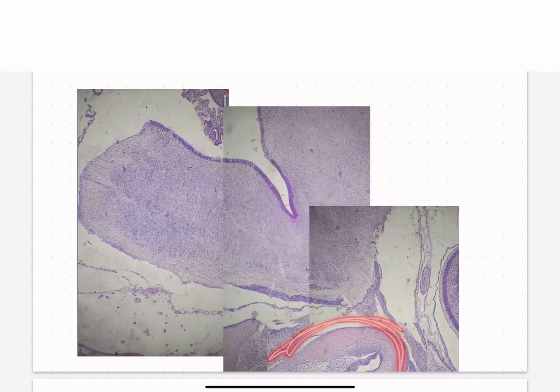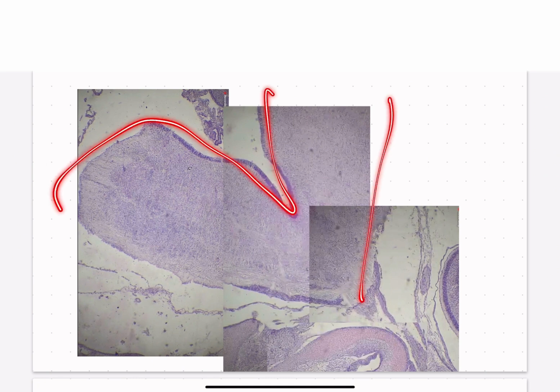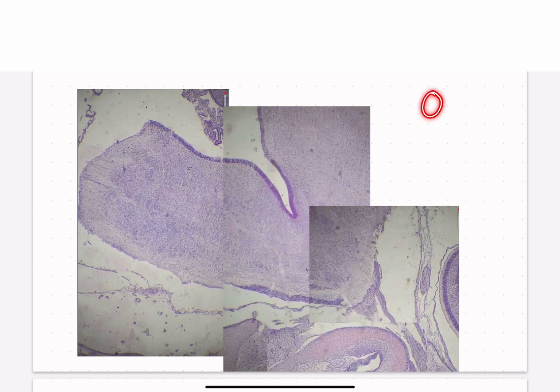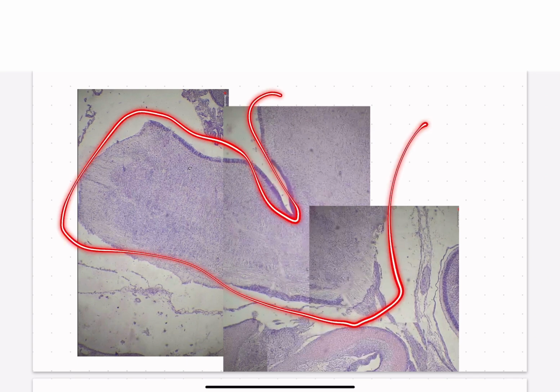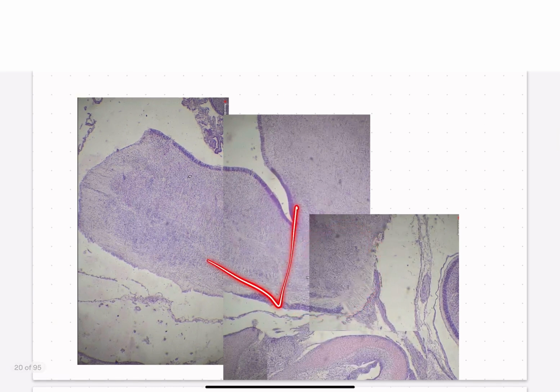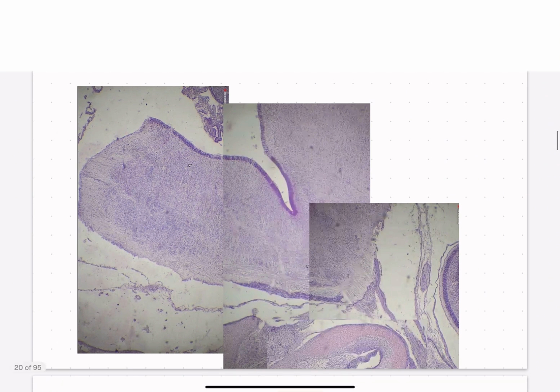This is still where we were, the inner ear development, but now we have this area instead. This, if you remember, looked like a little guy that was sitting down with the feet and the little knee, right? This would be the pons. This is the medulla oblongata, and this backside is the lamina quadrigeminea. So backside lamina quadrigeminea, it's just flipped, so it doesn't look like he's sitting down, but we can still see the characteristic knee and foot shape here. The knee is the pons, and the lower legs are the medulla oblongata.